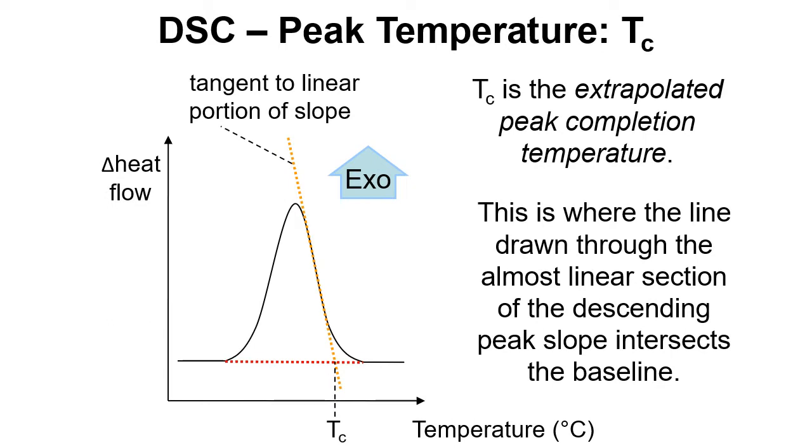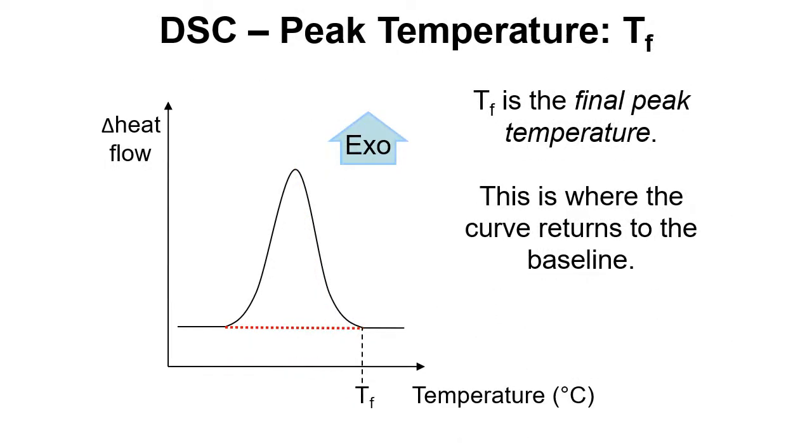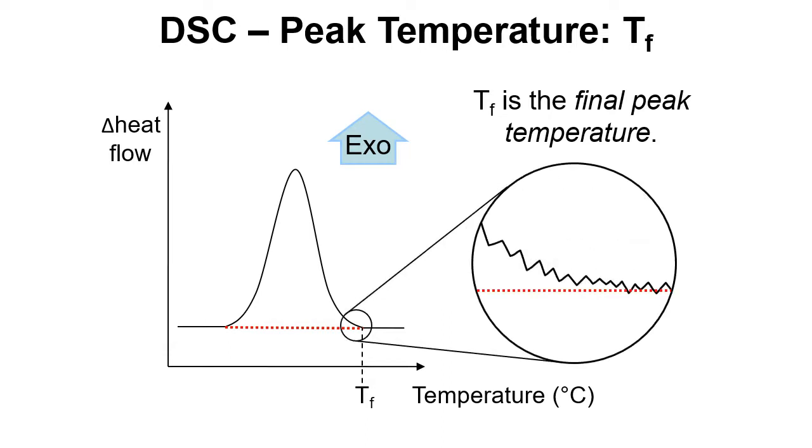Then we also have TC, the extrapolated peak completion temperature, and it's very similar to T subscript E. We draw a tangent through the steepest part here and we look at where that crosses the baseline. And finally we have TF, the final peak temperature where the curve returns to the baseline. Again we've still got these issues around this noise and how do we decide where the baseline goes? How do we decide when the curve has really returned to this? So it's perhaps a little bit less reliable. Perhaps we need to rely more on T subscript C for the completion temperature which is using the extrapolated values.